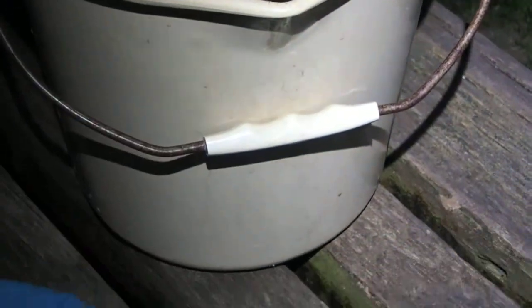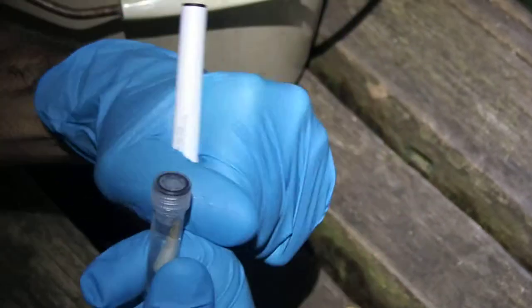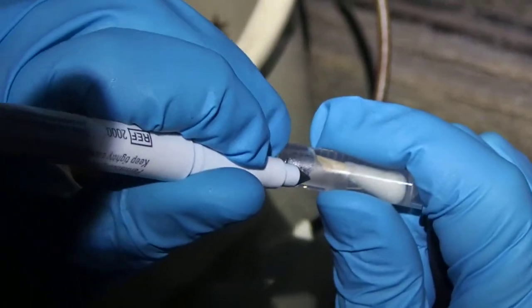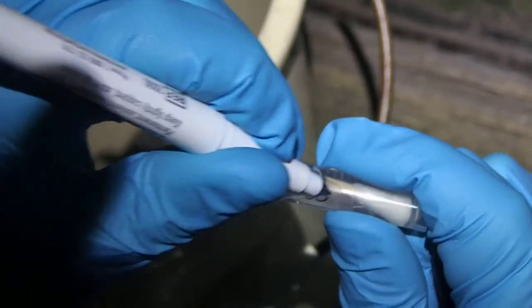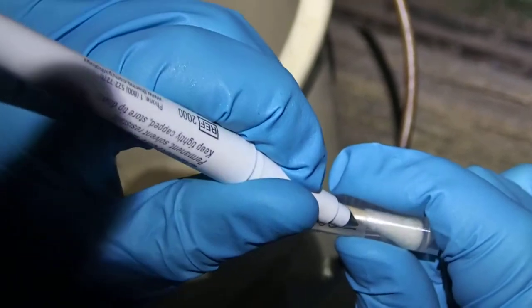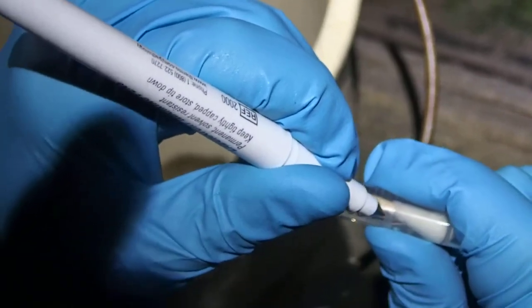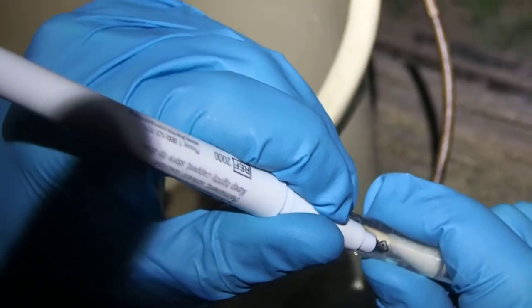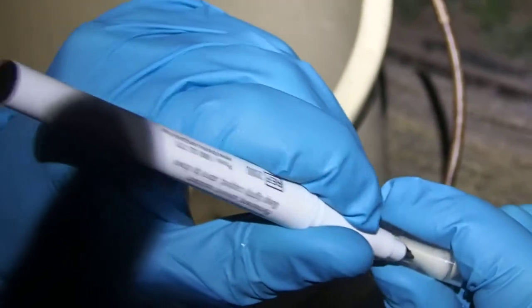Then we write on the tube. We do BB for Bufo bufo, underscore, then the sampling locality — so this is Dot Hill, so it would be DH — then zero one for the first sample.